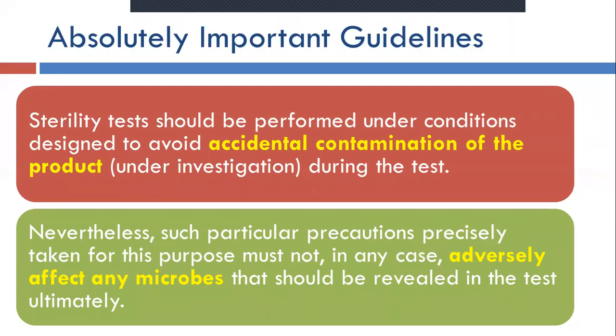Sir, can you explain the second point? Yes. See, what is the first point? That we have to take utmost care so that our product should not get contaminated during the testing. So we have taken the sample, and samples are already sealed and everything is fine. Now, while testing, there should not be any cross contamination so that you will get a false positive report.